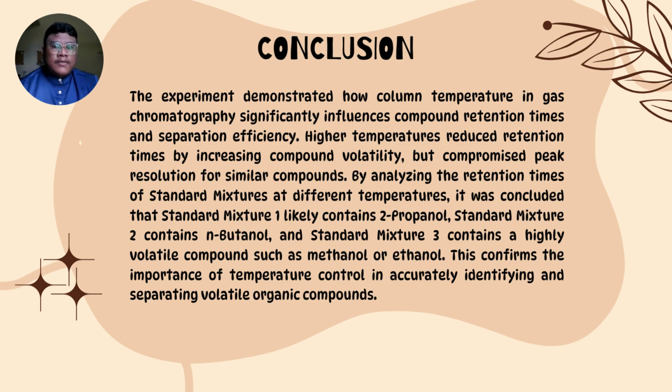2-propanol, standard mixture 2 contains N-butanol, and standard mixture 3 contains a highly volatile compound such as methanol or ethanol. This confirms the importance of temperature control in accurately identifying and separating volatile organic compounds.